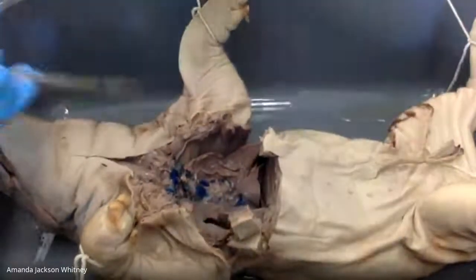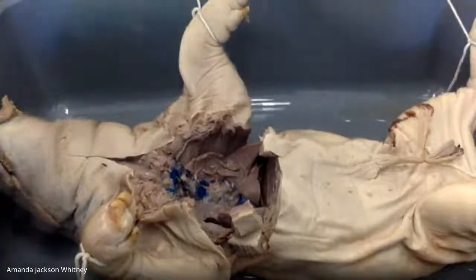All right, we'll look at the lungs again in a little bit, but for now, I might scoot Louis out of the way and go grab a paper towel and look at the heart. Does that sound like a plan?